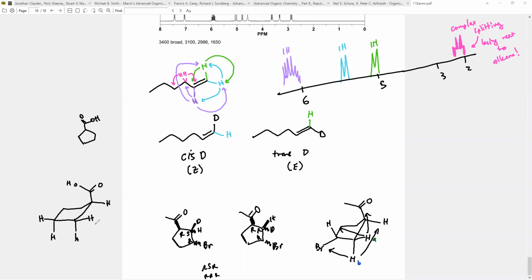Okay. Now this would be a case where the shift would probably be very, very close, but it would still be a different one. We would still have a different estimation, or a different chemical shift, sorry, on these hydrogens. Now, these hydrogens, it's a bit more difficult to say because really their chemical environment is just these other H's here. And depending on the actual crystal of the molecule, because we don't really know what the actual distances are.